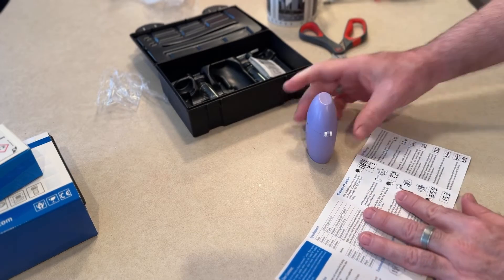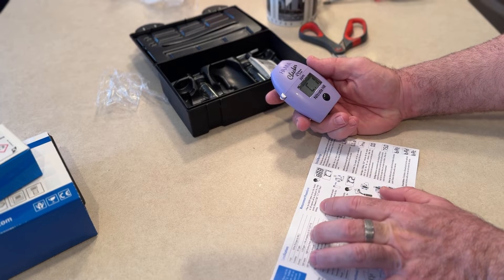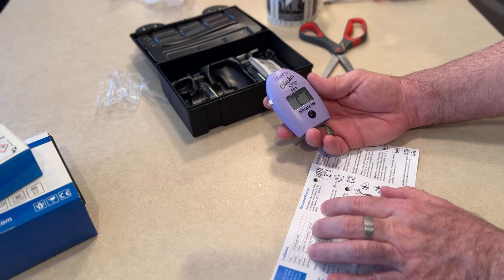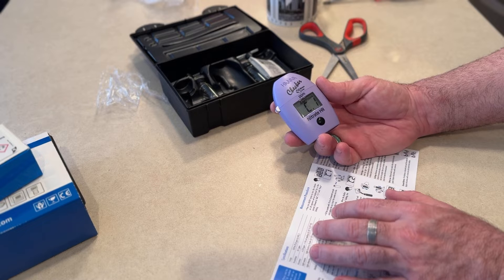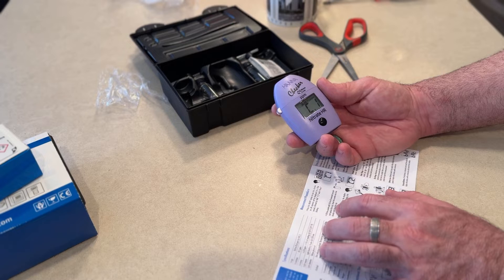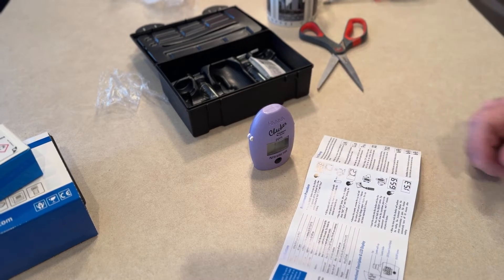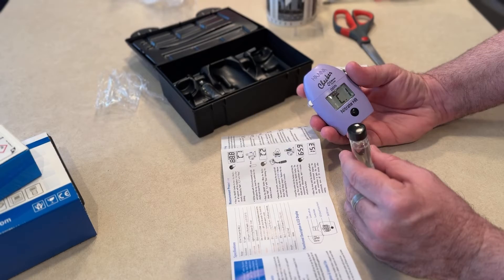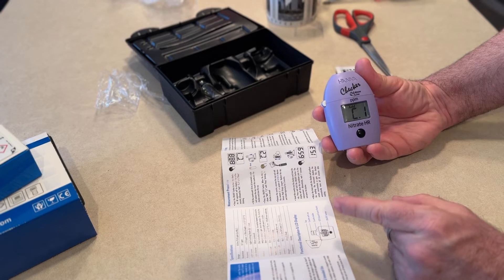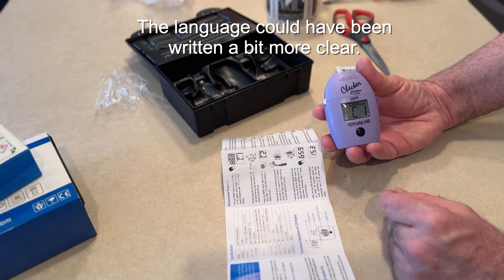Press the on/off button to turn the checker on. All segments will be displayed for a few seconds, followed by 'Add C1' with press blinking. Fill the cuvette with 10 milliliters of unreacted sample water, replace the cap, insert the cuvette into the checker, and close the cap. Get some water, screw the cap on, insert the cuvette, close the cap, then press the on/off button. When the display shows 'Add C2' with press blinking, the checker is zeroed.